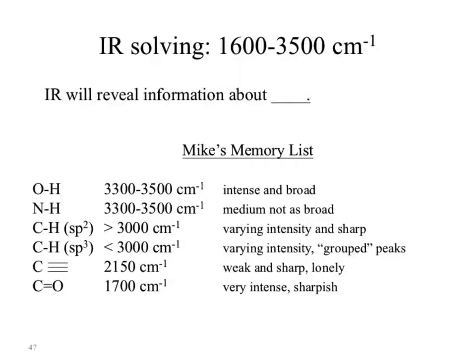Those things can vary wildly. This is where it comes to experience, to looking at these things and seeing when and where they show up. So those you should absolutely commit to memory. That nails down, at least passing, I would argue, as far as IR spectroscopy goes.